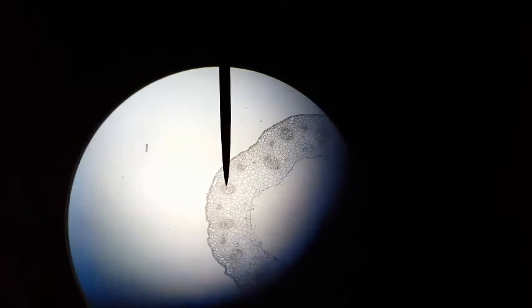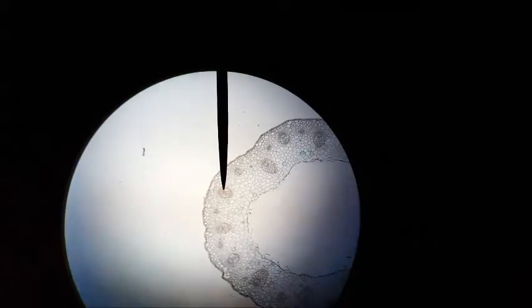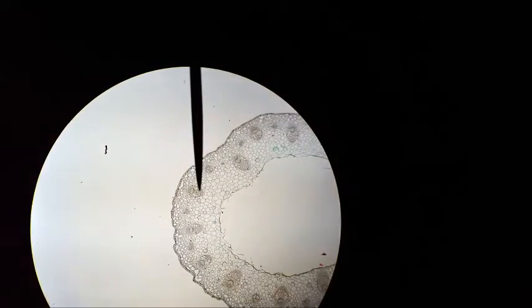Just to the right of the phloem will be the xylem, which are the more open cells. The pointer is now on the xylem — the more open, larger cells.